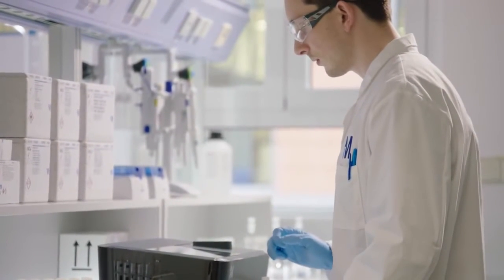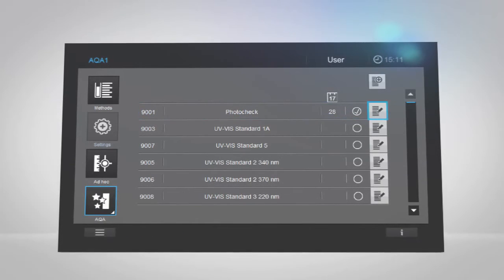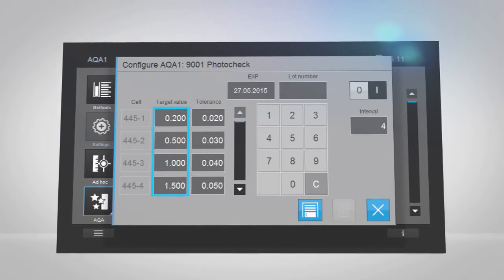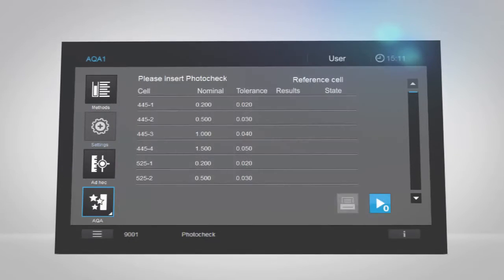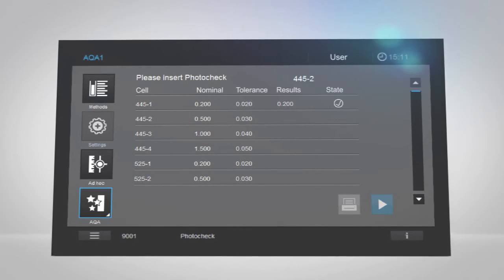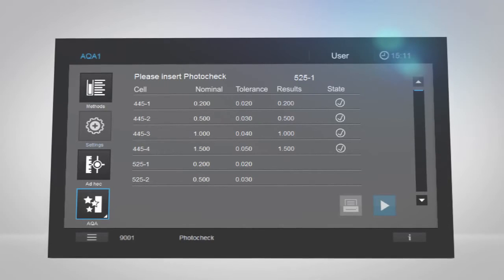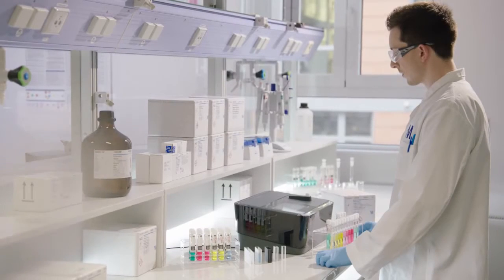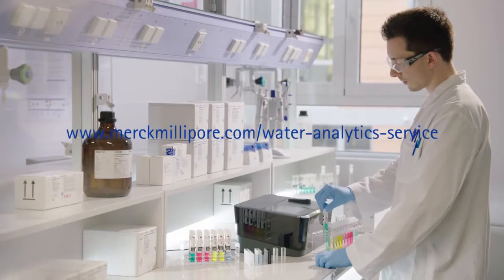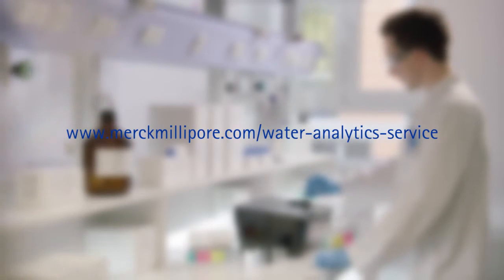The PhotoCheck function allows you to test the status of your SpectraQuant Prove spectrophotometer, giving you an economical alternative to expensive filter sets. Simply go to the AQA menu, tap AQA1 and select PhotoCheck. The software will provide all necessary information and instructions. Please adapt the target values according to the PhotoCheck package insert and click Save. The table shows the required measurements, which cell you need to enter next, expected results and tolerance. Follow the directions in the table and insert the correct cell for every measurement. You will immediately see whether a measurement has passed or failed the test. If you are still not sure whether your instrument is working correctly, contact our service and support team for a personalized SpectraQuant service plan at www.merckmillipore.com/water-analytics-service.